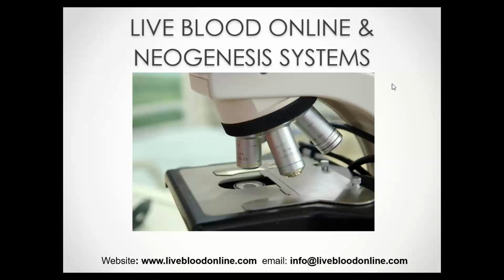The real value of live blood analysis lies in its ability to uncover the underlying imbalances in the body's internal environment that have facilitated the development of disease. So although it can't be used to diagnose disease, it provides valuable information on the underlying causes of disease, which is very difficult, nearly impossible to uncover with any other technique.